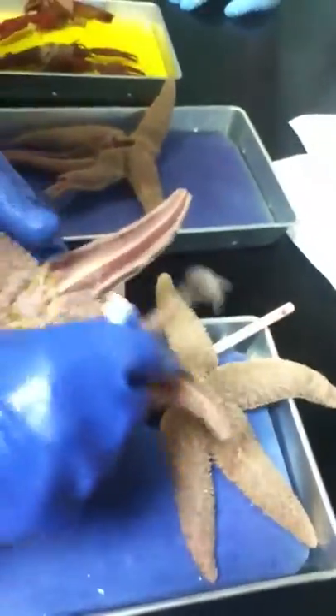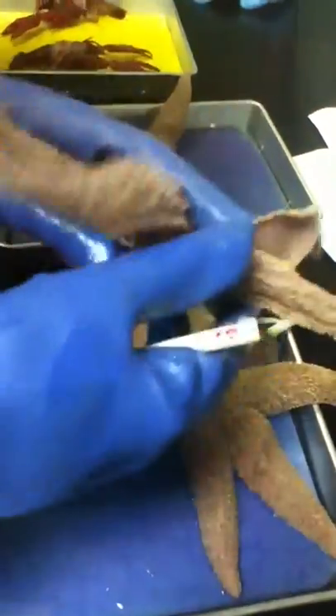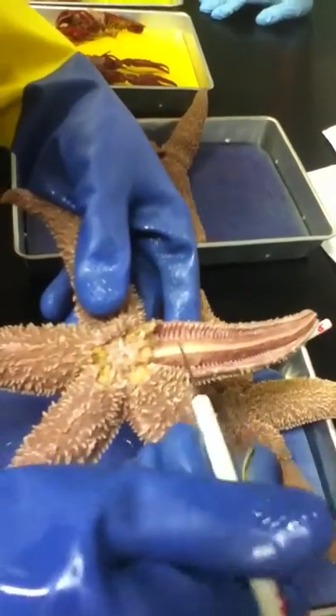To see the tube feet, you have to look on this side, right here. Those are the tube feet. The tops of the tube feet are the ampulla — they're like little medicine dropper tops. They look like bubbles.